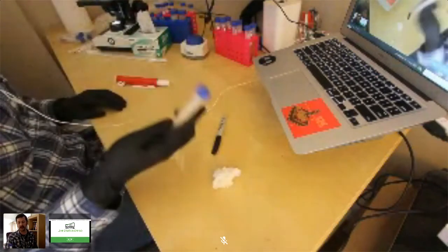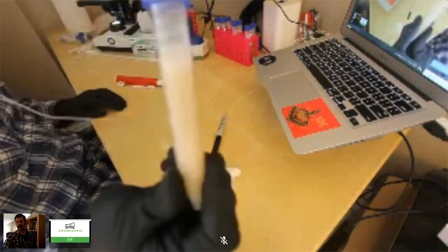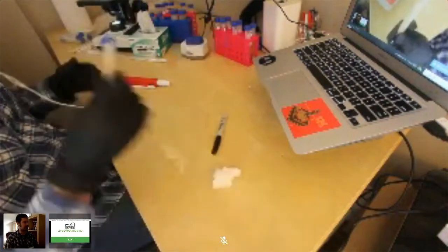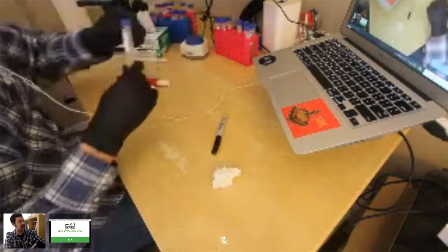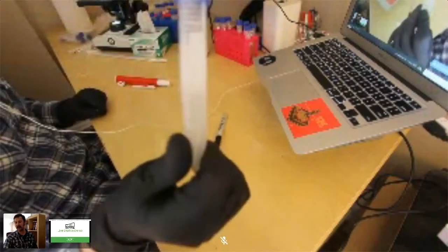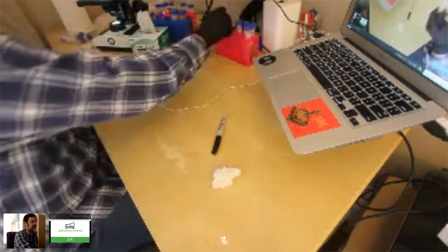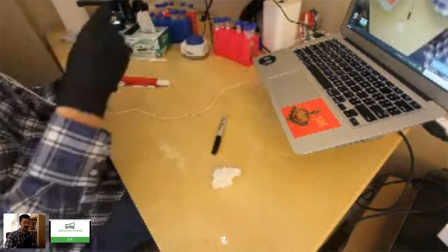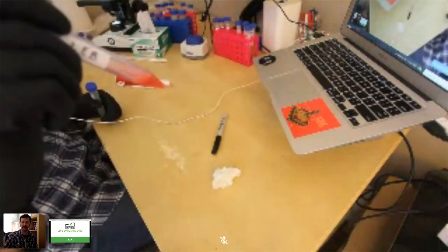Now this is a 1 in 100 sample. This is still pretty turbid, so I still wouldn't be able to work with that. So eventually you'd get a dilution down to a 1 in 100. This is still pretty thick, but I'm not going to worry about it because we're just going to do the dye after. So this is a 1 in 100. Now what I want is I have these prepared samples of erythrosin B. So this is 1 milliliter of erythrosin B.